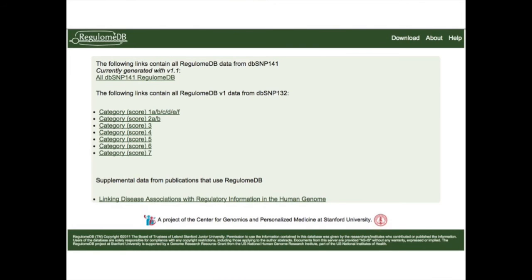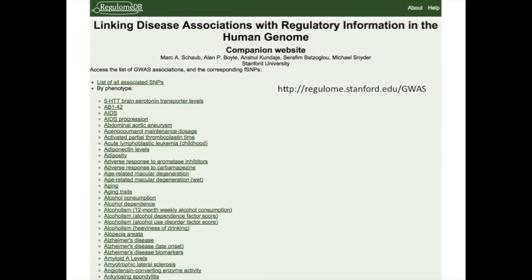If you want to more systematically analyze your variants, you can download all this data from the downloads page. Also, if you go to regulome.stanford.edu/GWAS, you'll see curated sets of variants associated with different phenotypes and diseases. You can download, for example, an entire list of annotated variants associated with aging or asthma. So if you're focused on a particular disease, you can also investigate that way.